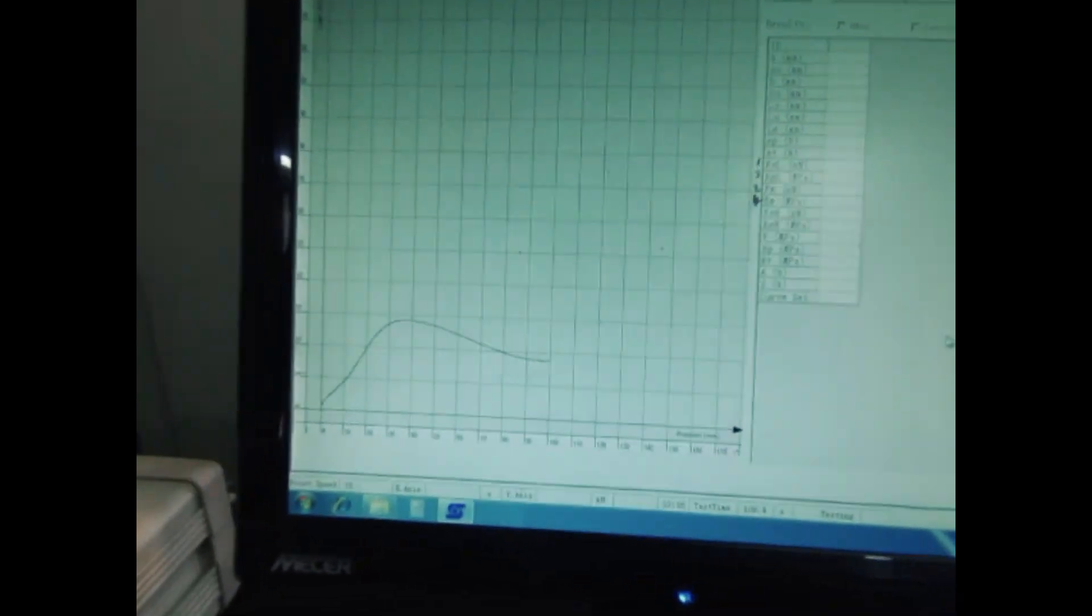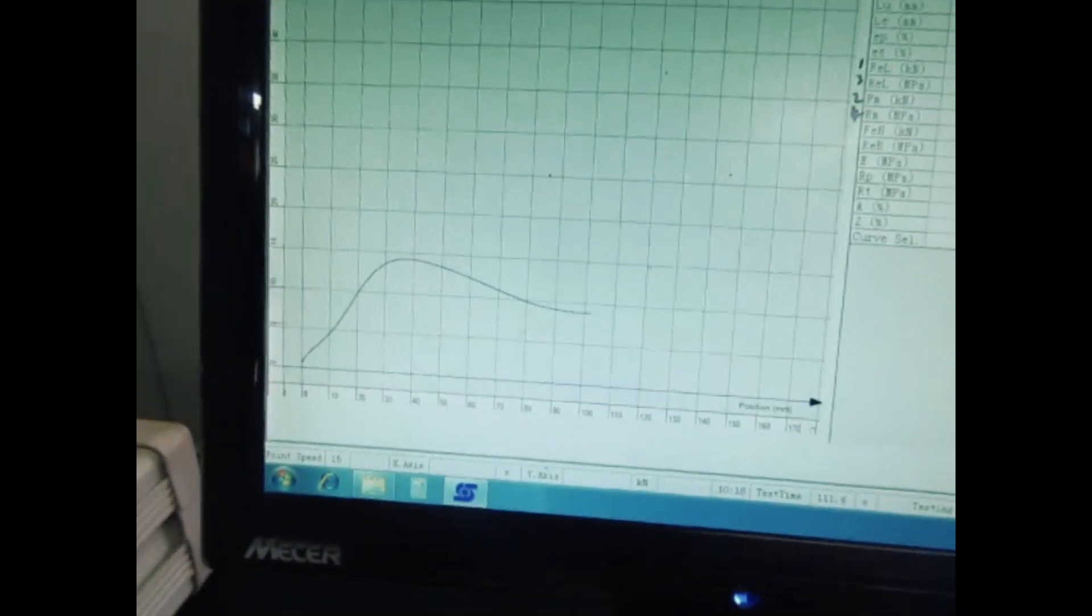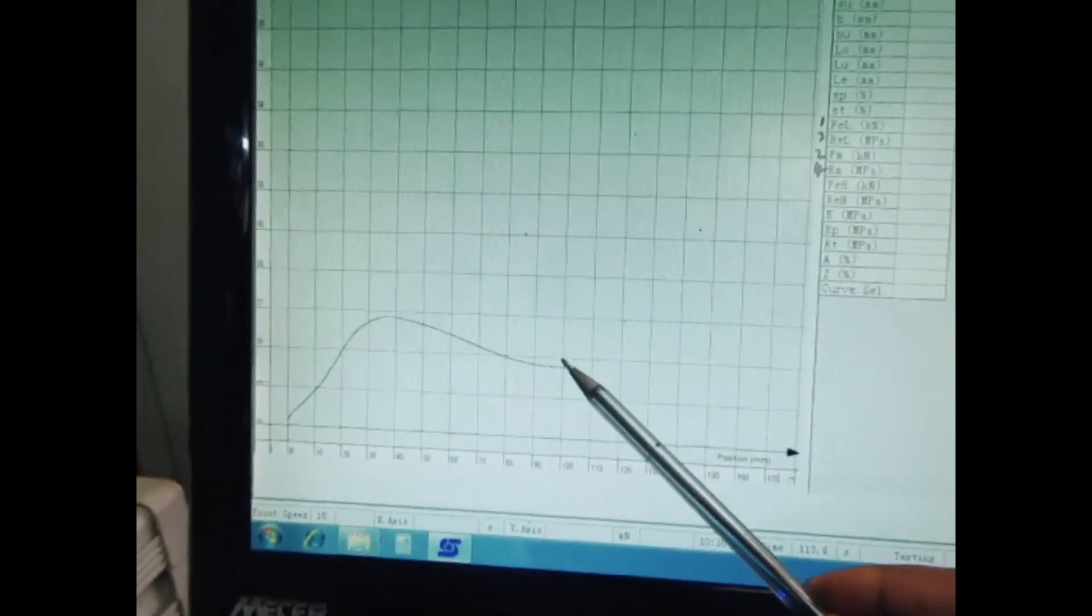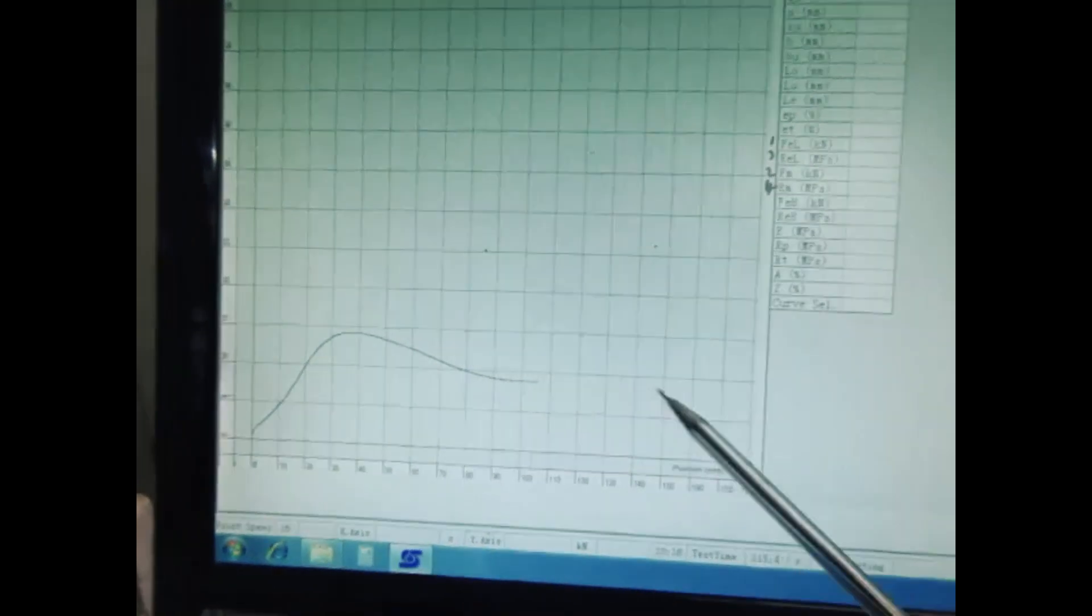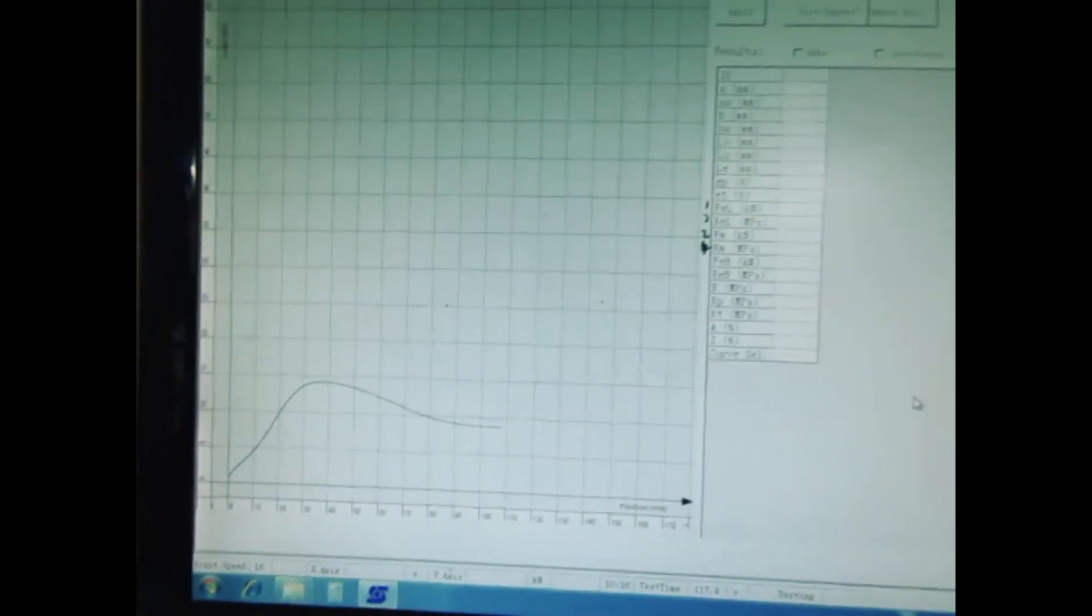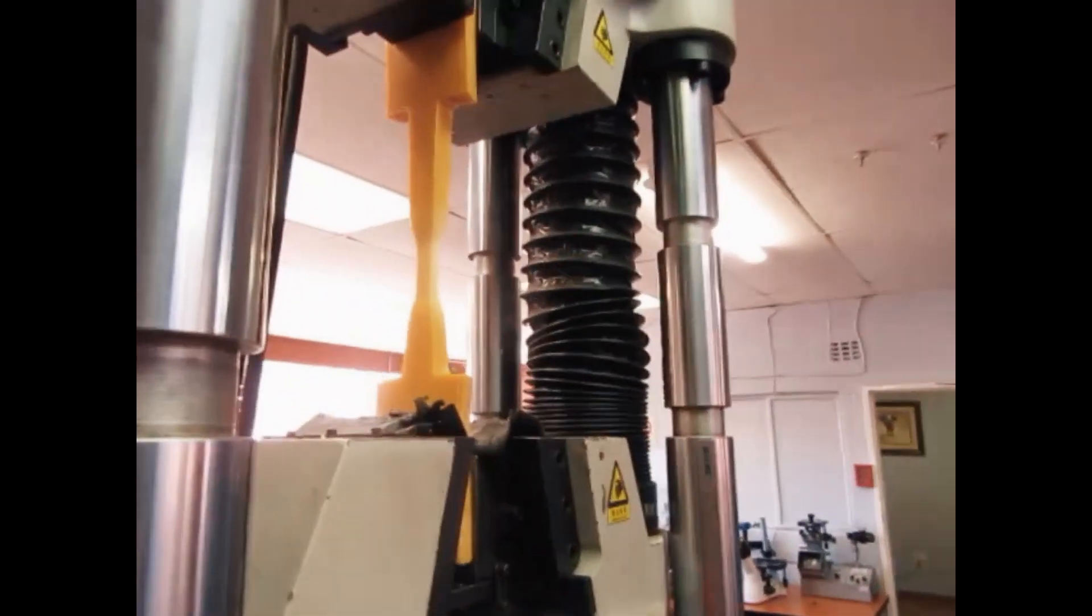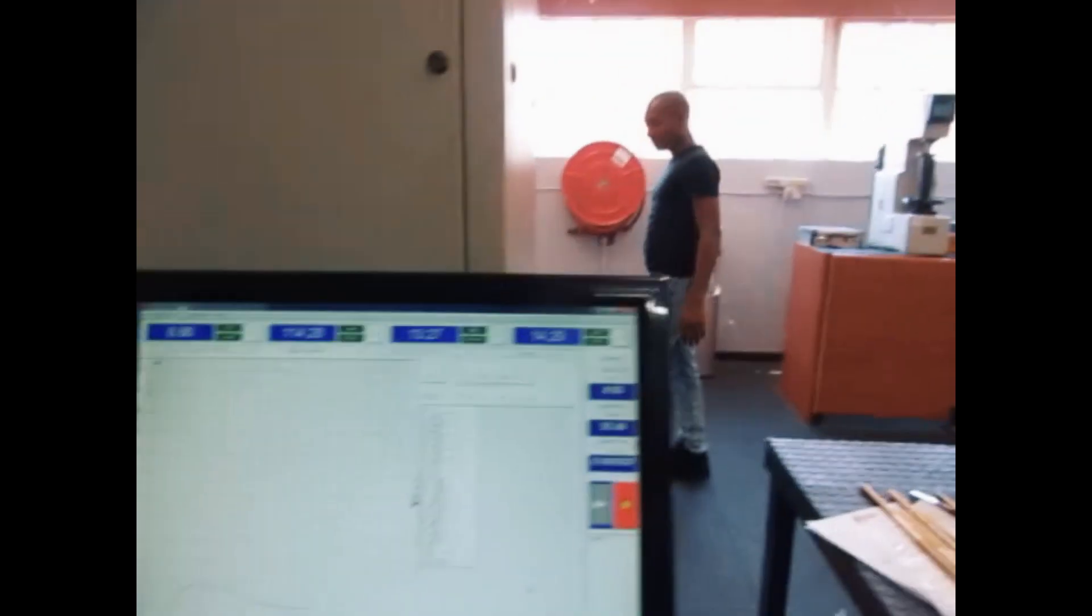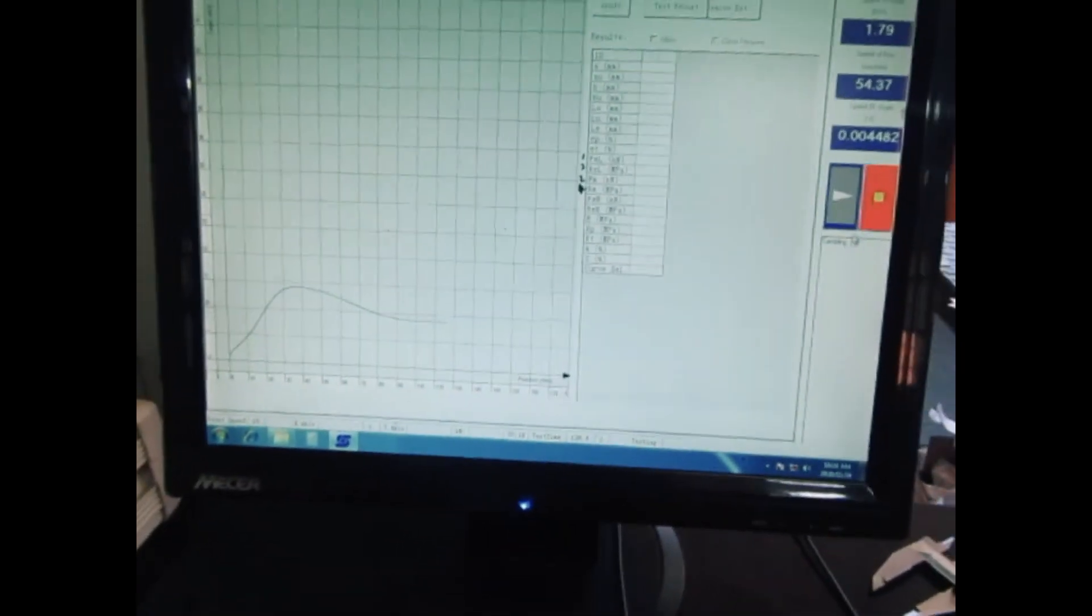So there it's making, making, making. And if you can look at my graph here, my graph is going down. The load is almost constant. It's just going on straight. So what I'm gonna do is, since I don't need much of that, you can see, I'm just going to stop and carry on with this.